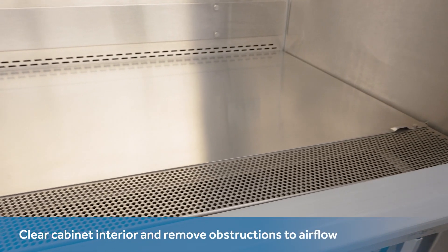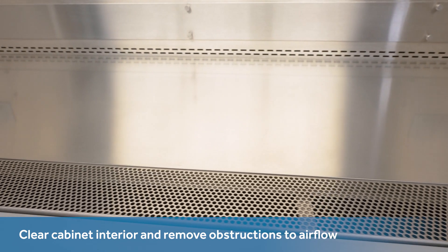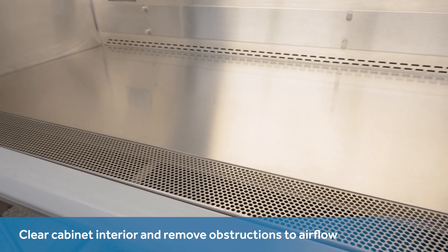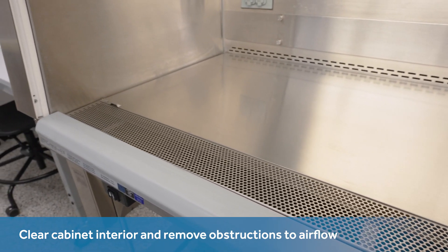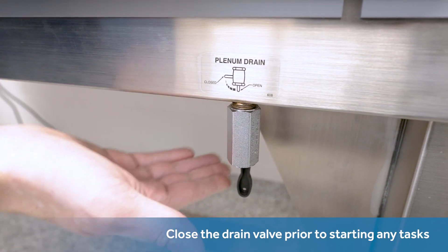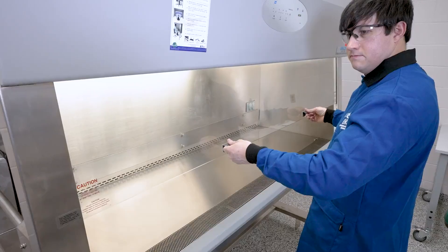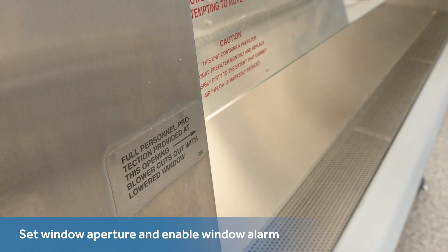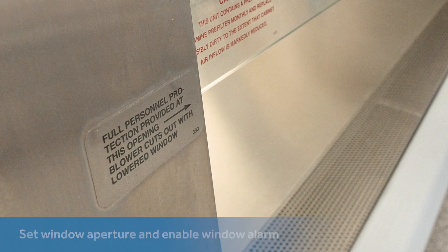One suggested best practice is for any blockages to be taken out during a review of the slots that pull the air in. Although IV bars and ultraviolet lights can remain, the cabinet interior can be emptied of any other objects. Close the drain valve prior to starting any tasks inside of the cabinet. Industry experts remind you to take care that the aperture of the cabinet's front window is set correctly and to have enabled the window alarm.